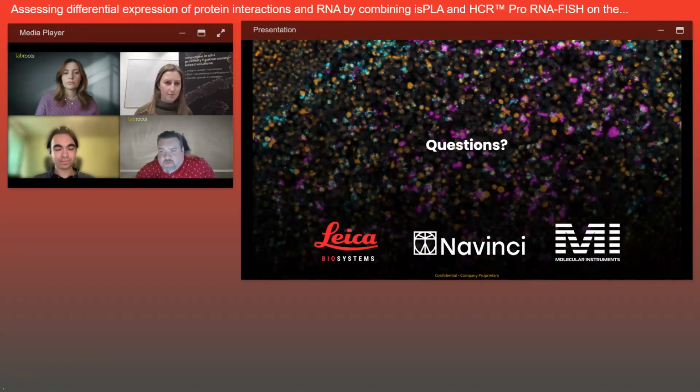For Joseph, can we request the probe binding sequences after design is complete? Yes. So that's something that you can do, no problem. No extra fee for doing so. You can just request it via email. We're happy to share those with you during the probe design process.